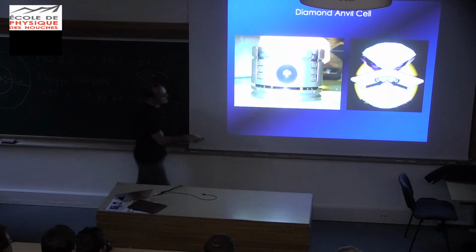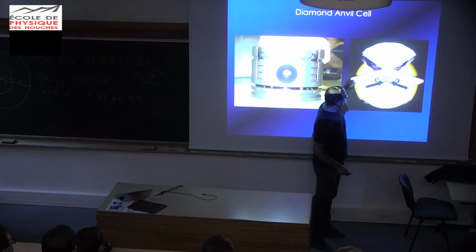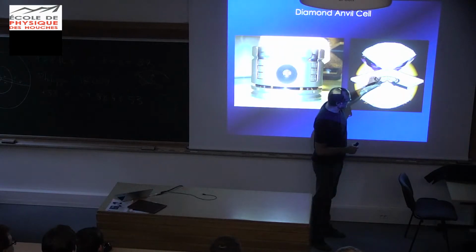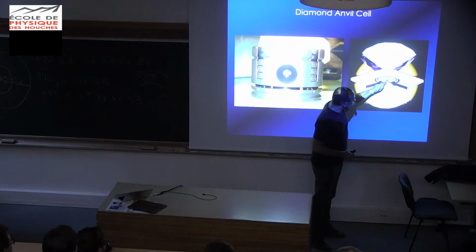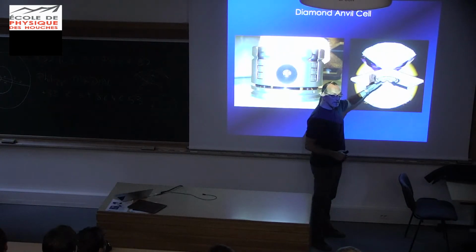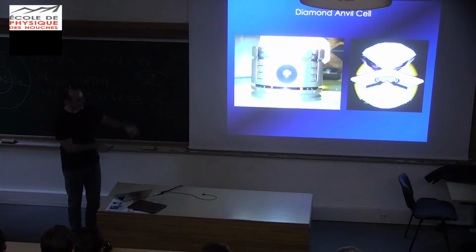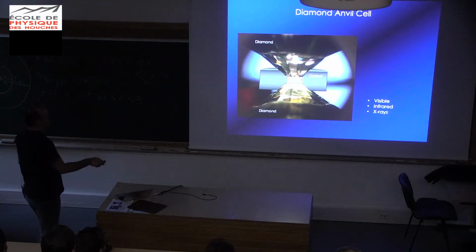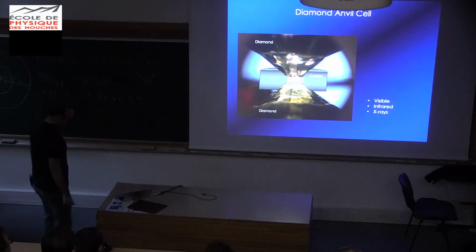Basically you have two gems that have been truncated at the bottom to have a flat surface. And you put a little foil that's going to serve as a gasket. Your diamonds are going to press on the foil. You're going to recover the foil, drill a little hole, and put the foil back. Then you put your sample in the hole, then you close the diamond, and off you go. This is how you make your assembly, how you create your sample chamber. You see it here: a gasket, diamond, sample, and a pressure marker if you want.